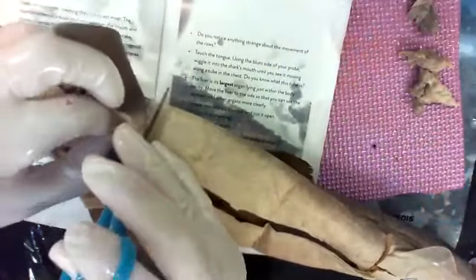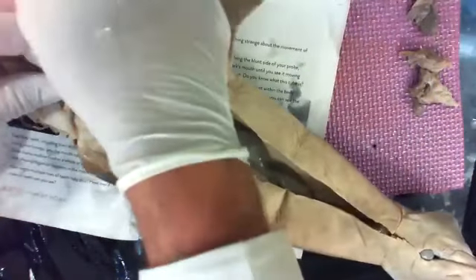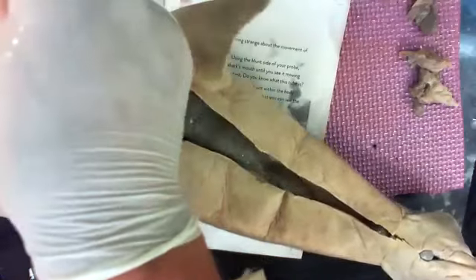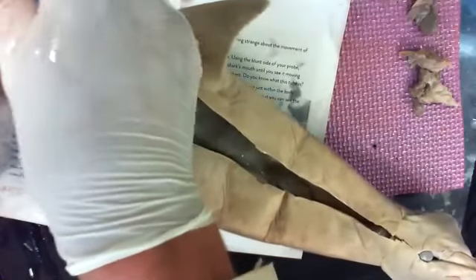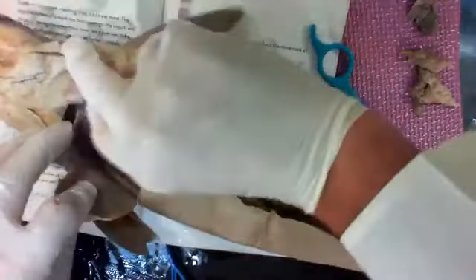All right. I'm going to make two more cuts like this one down here, right underneath the pectoral fins. Oops. I'm going to make a cut over. I'm not cutting the fin. Okay. And right here, I'm going to make a cut over. And now I can open this up like a book. And if the chest is in the way, I'll just cut into the tissue here. Oops. So I can open it all up.